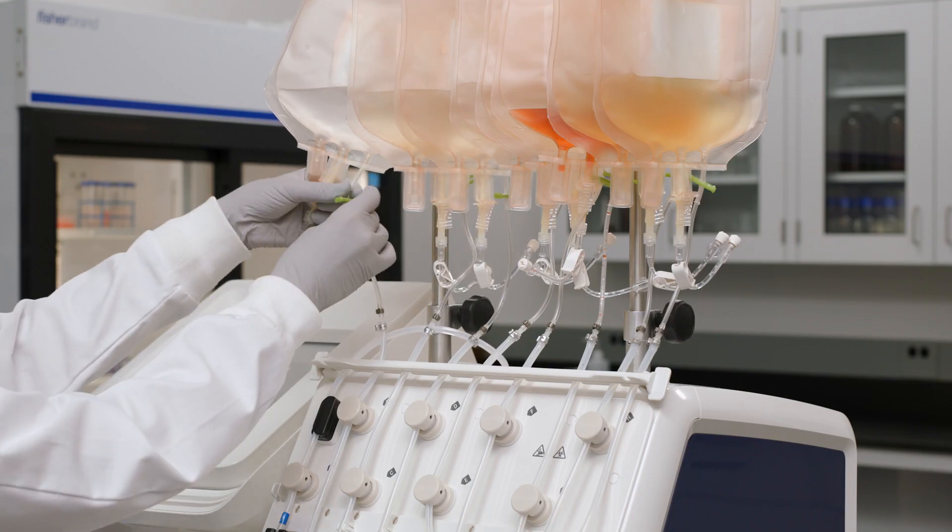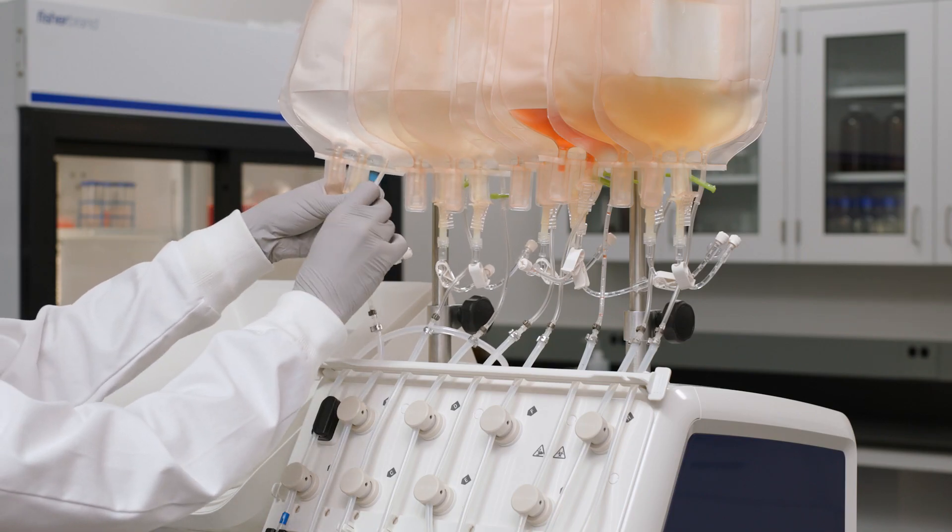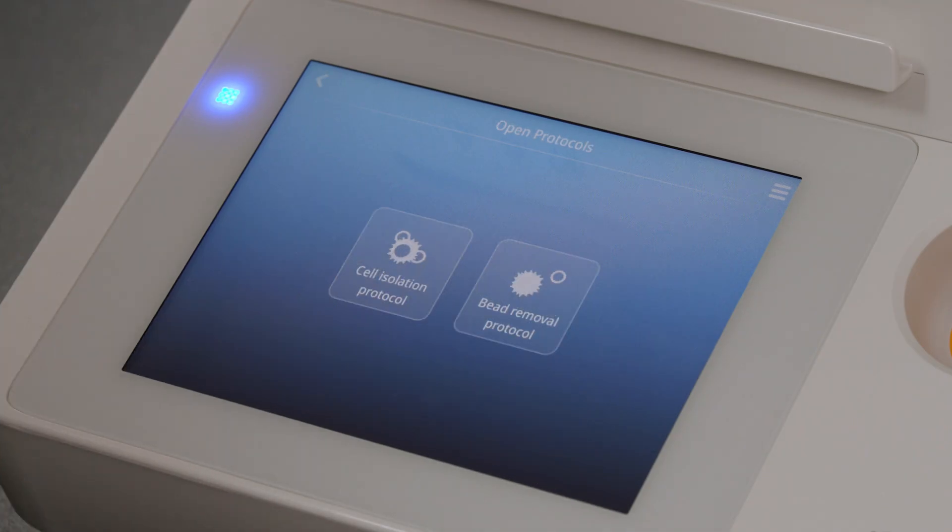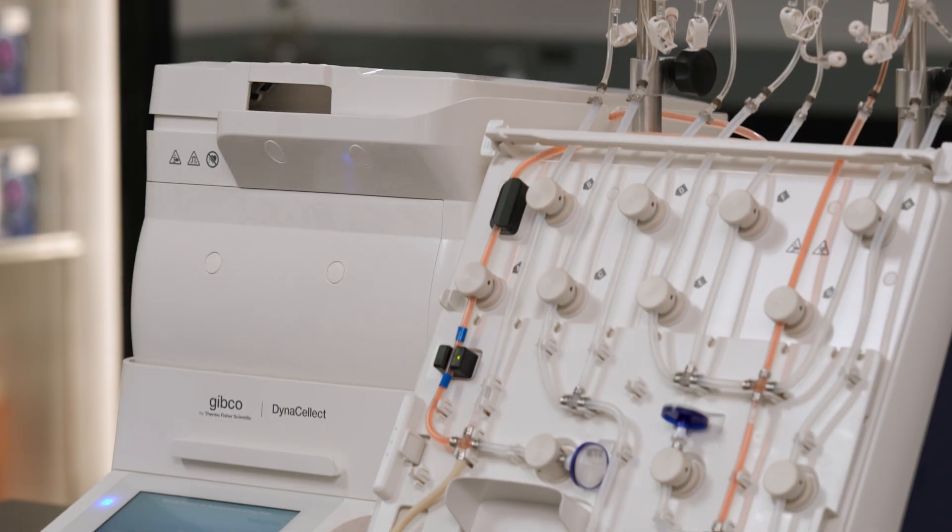Finally, remove or open all clamps in the bags and press on the tubing where the clamp was to ensure there are no kinks in the tubes. Now your DynaSelect system is ready to run.